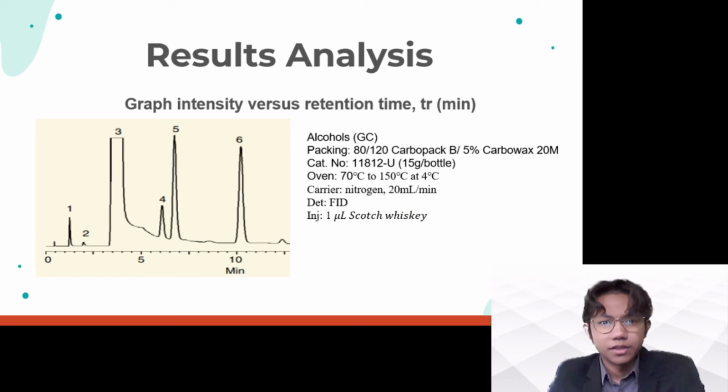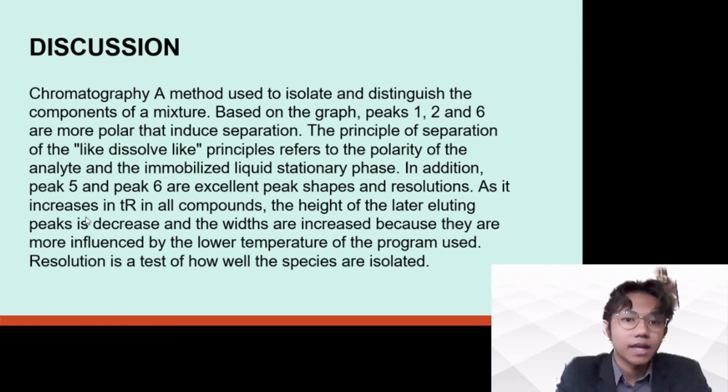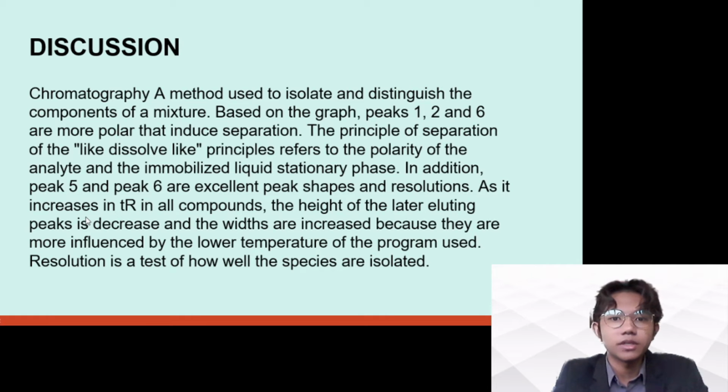For the discussion, chromatography is a method used to isolate and distinguish the components of a mixture. Based on the graph, peaks 1, 2, and 6 are more polar, which induces separation. The principle of separation, like dissolves like, refers to the polarity of the analyte and the immobilized liquid stationary phase.